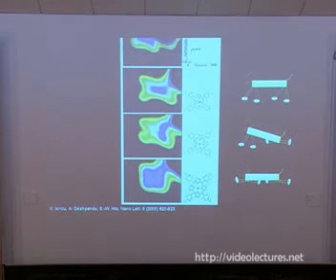And this is shown with the examples here. When we switch, we can see two-step signals, which means it changes twice. Now the two lobes, which is bent, I show with a small dog here. It's standing up. If you inject the electrons, half of it is flattened. So the leg is here. Half is flattened, the other half is still bent. If you inject again, now it's completely flattened. You now have four lobes.